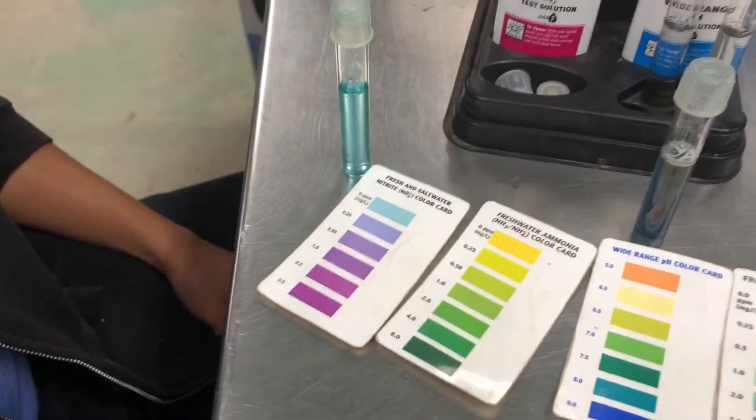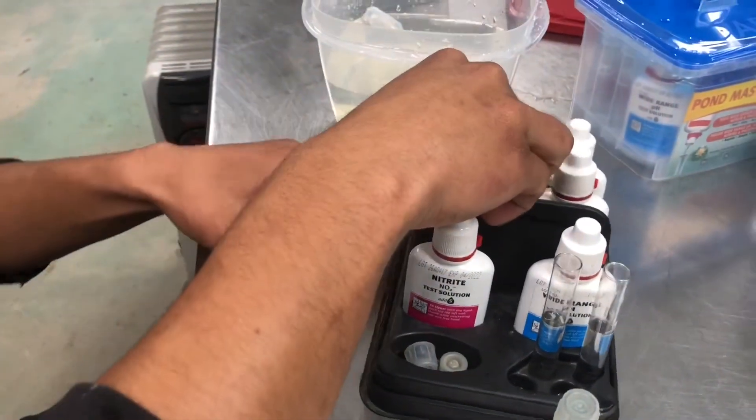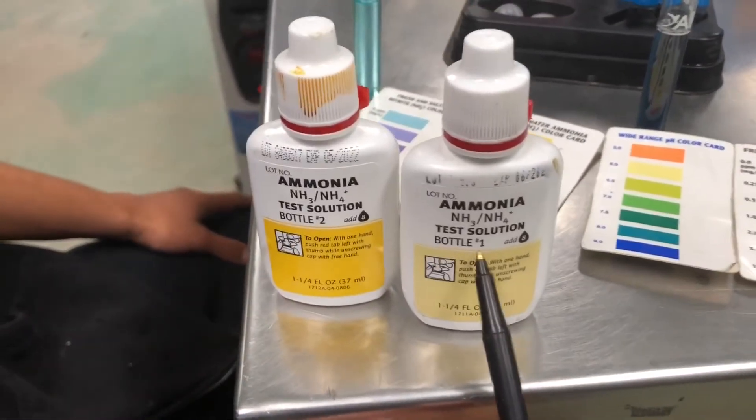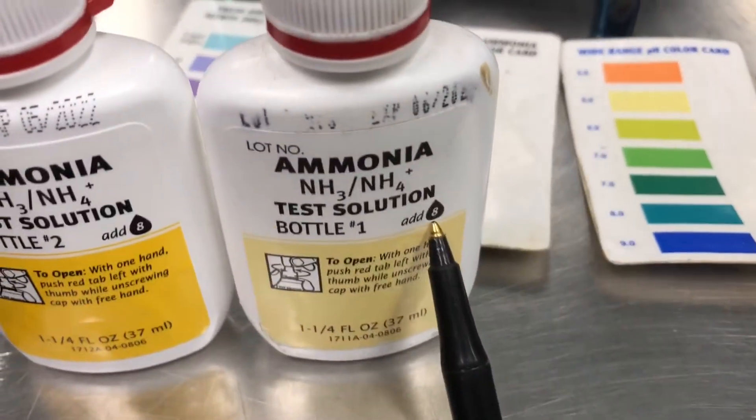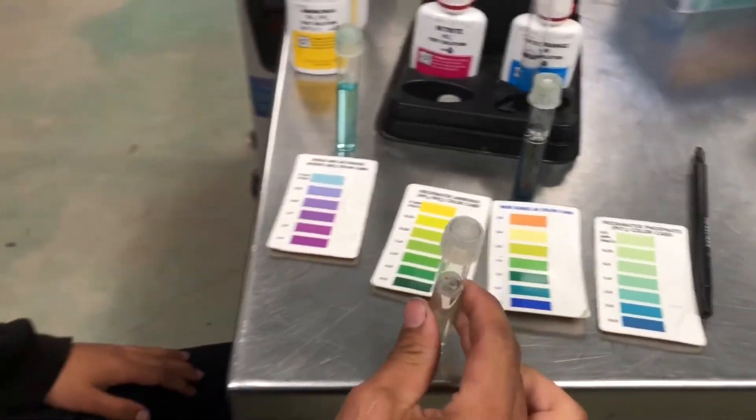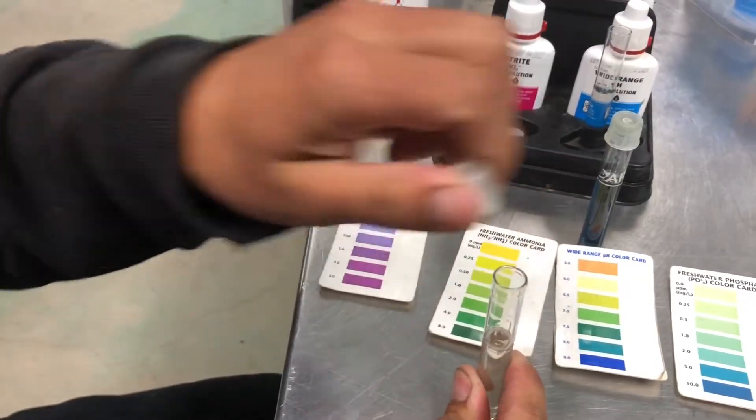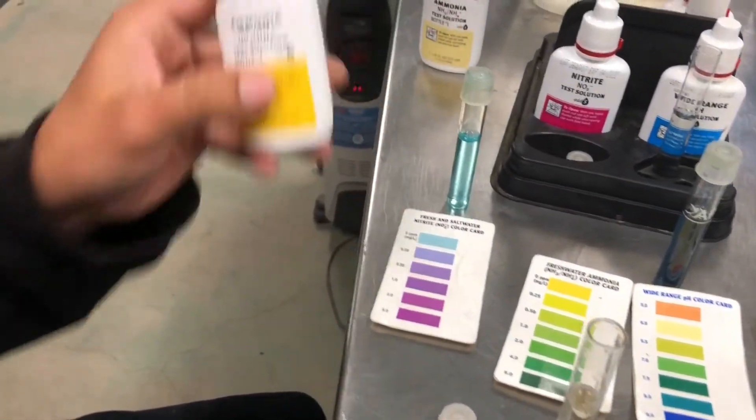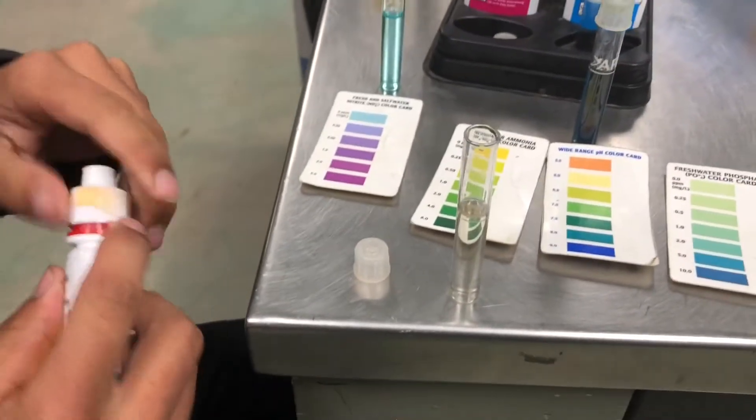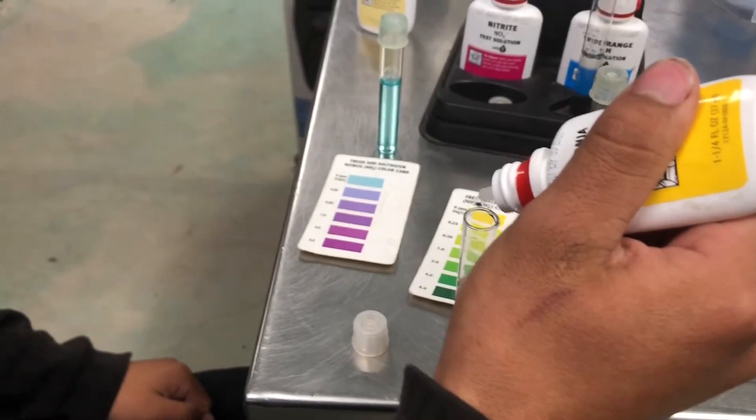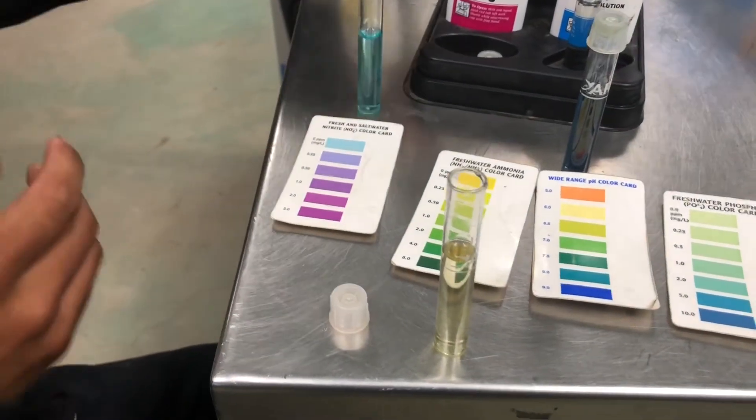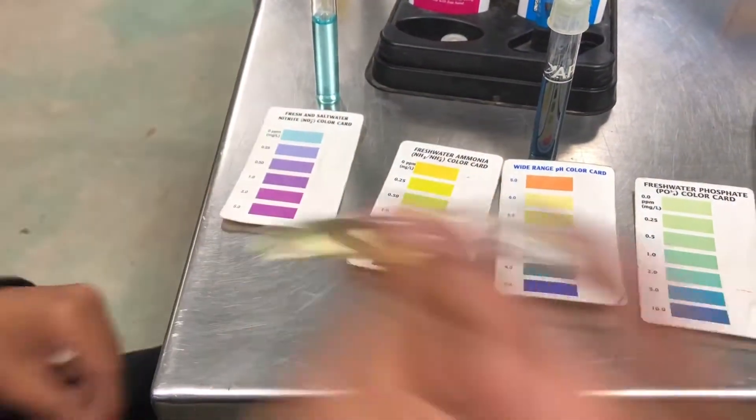Okay, so now the ammonia. Ammonia is going to be a little different. It's a two part. And the first one, let's see, it says bottle one. And it's going to be eight drops. Okay, so you want to do bottle one first. Okay, so now let's put bottle two. And bottle two, it says the same thing. It says add eight drops. Okay, and do the same thing. Put the cap on. Give it a good shake.